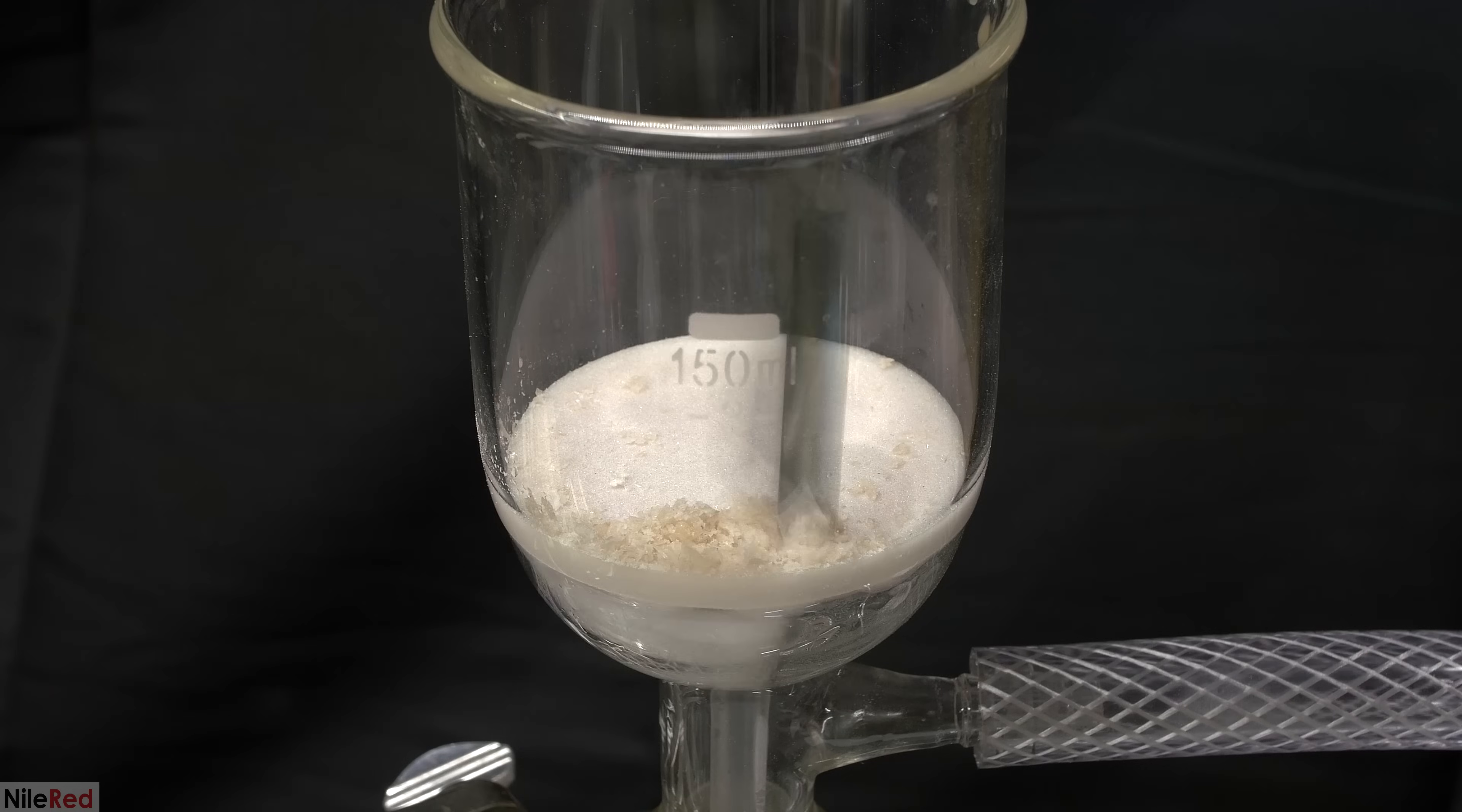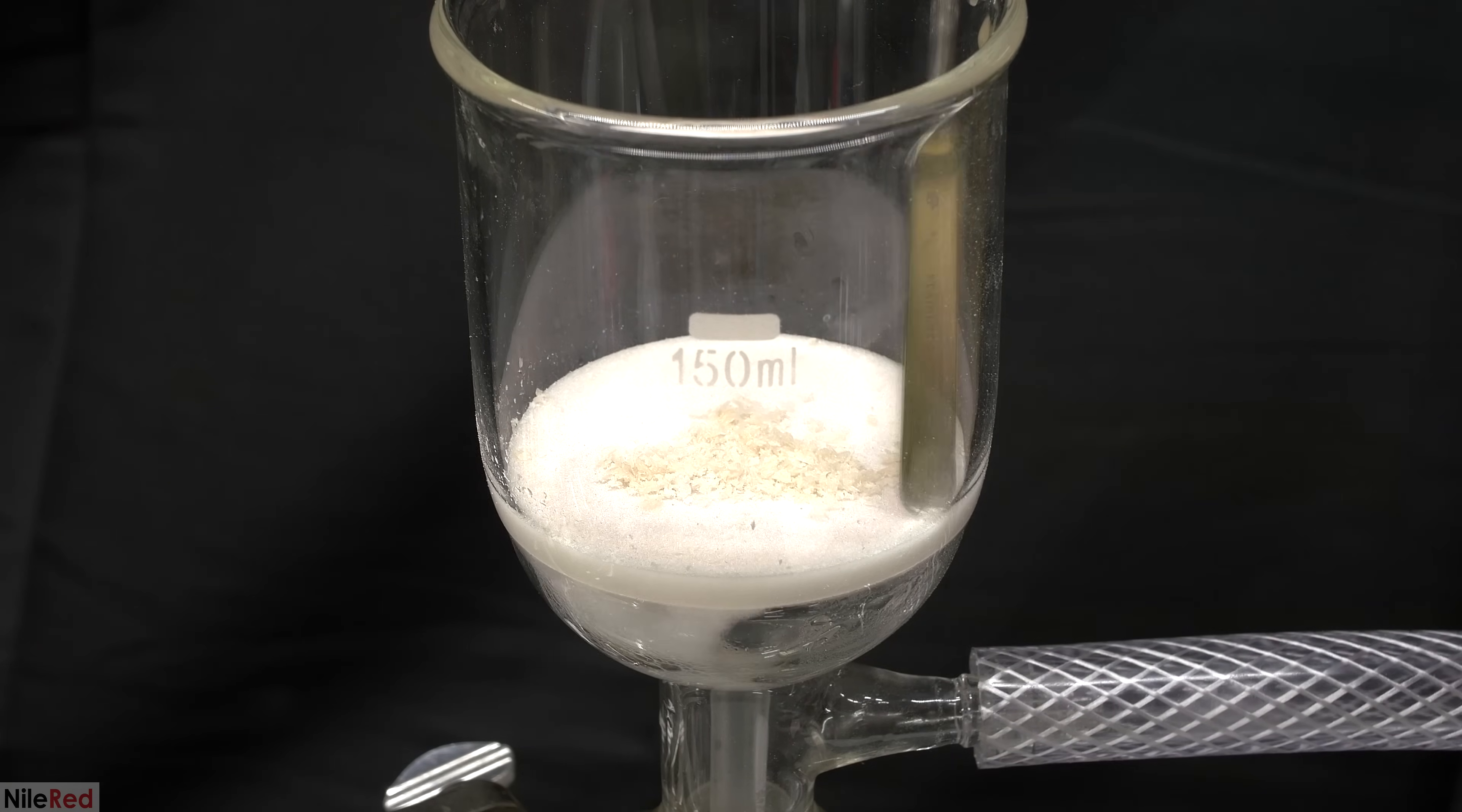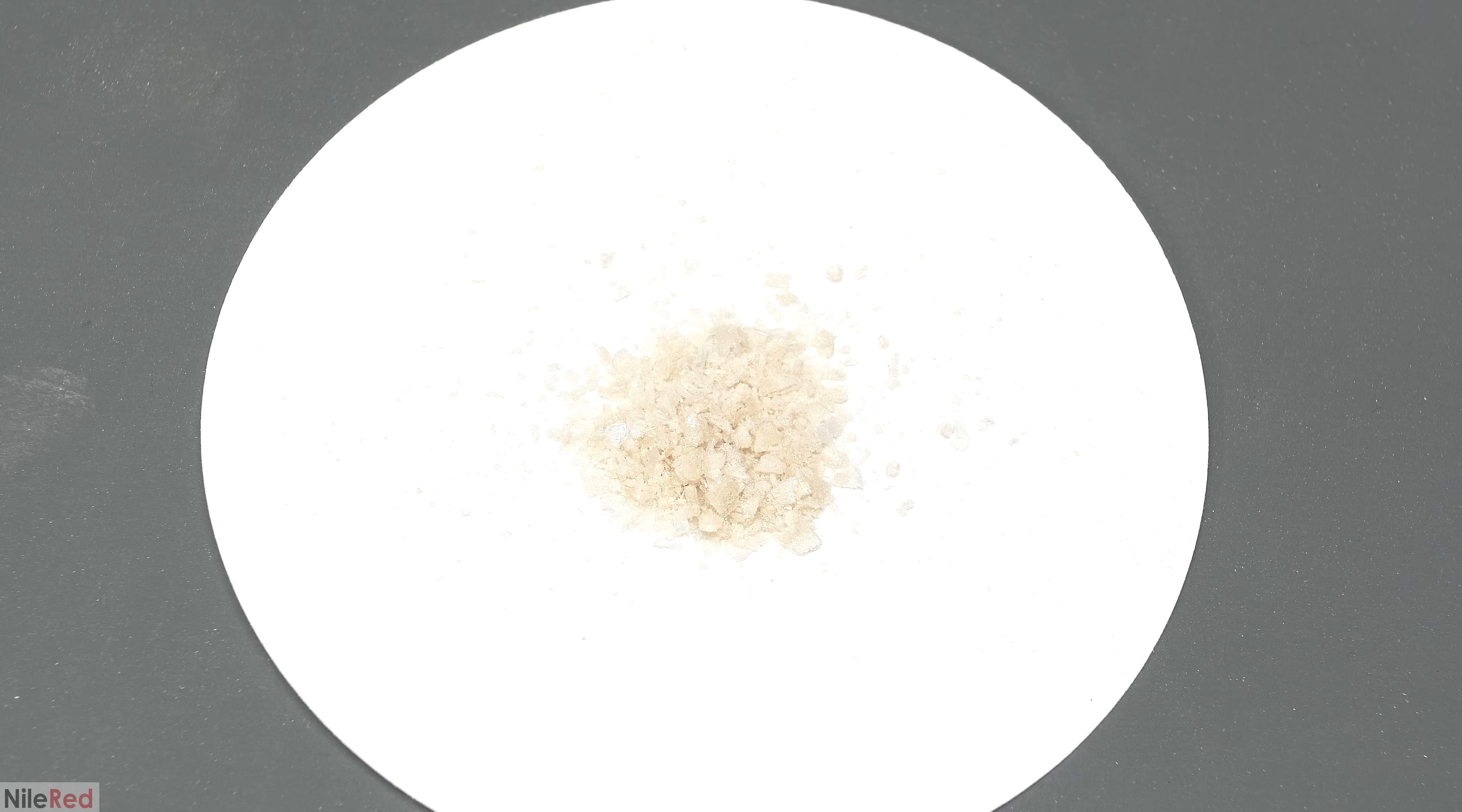I kept the vacuum going to dry them up, and using a metal spatula, I scraped them off the filter. The crystals were transferred to a filter paper, and although they're not super brown here, they're still evidently discolored.